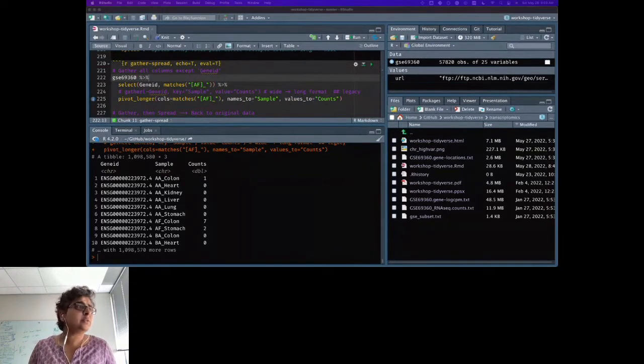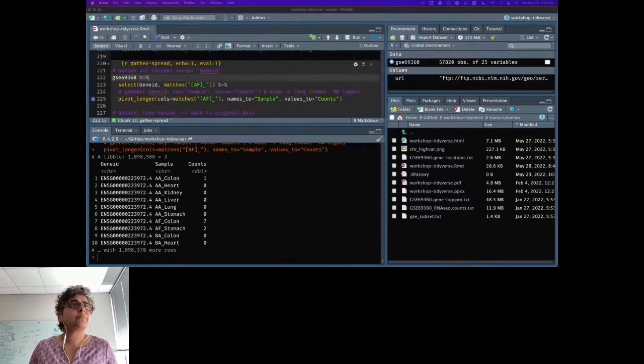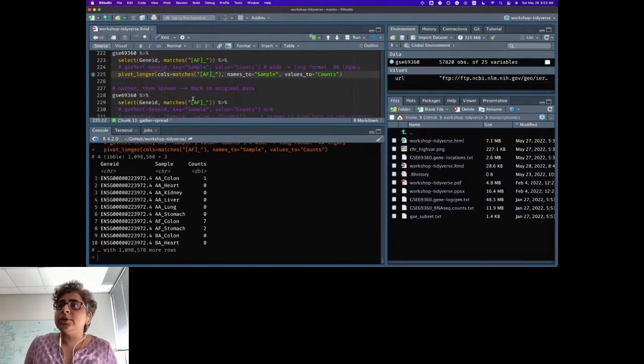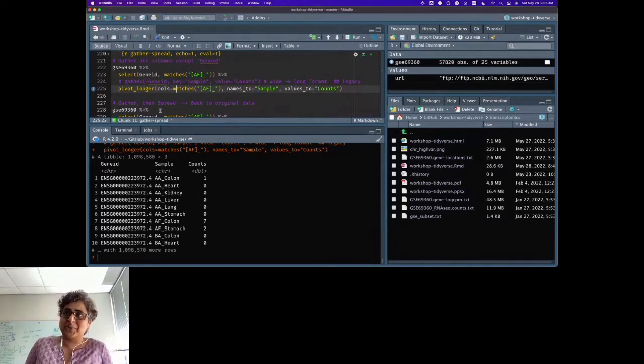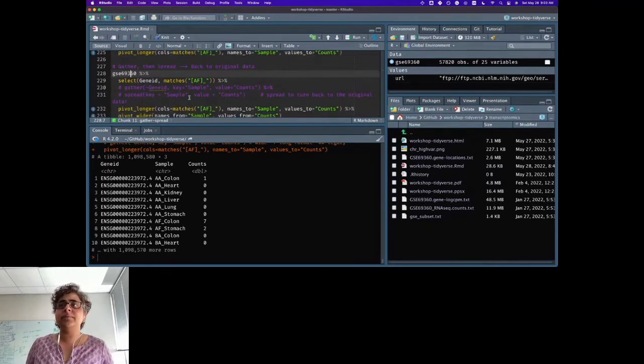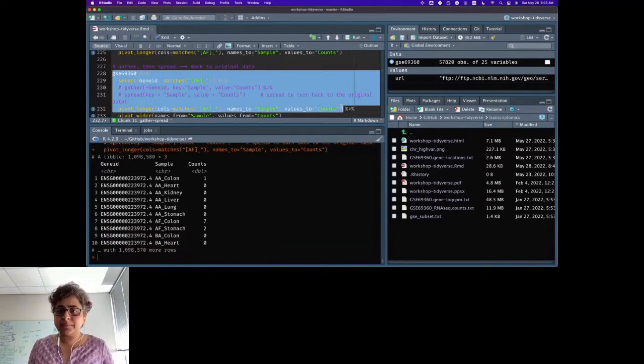Let's see. Everyone with me so far? No questions so far. Thank you, Janani. And we are also going really slowly, which could explain why we have no questions. Okay, good. So now if you just want to go back to the original data, up until this point is what we have already done.